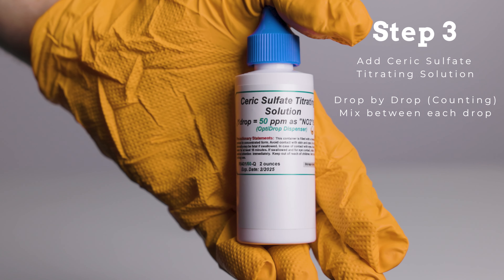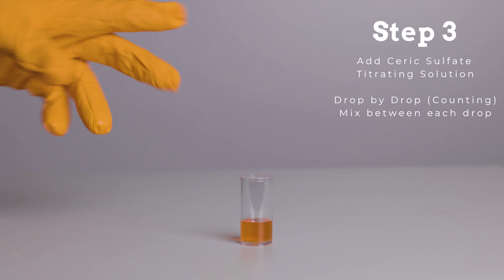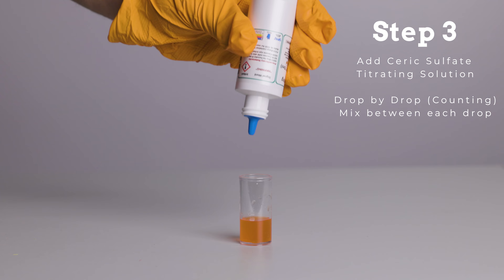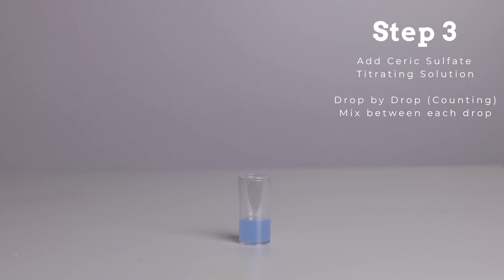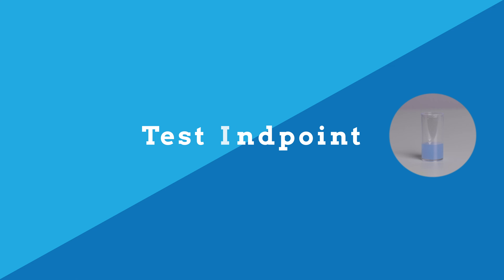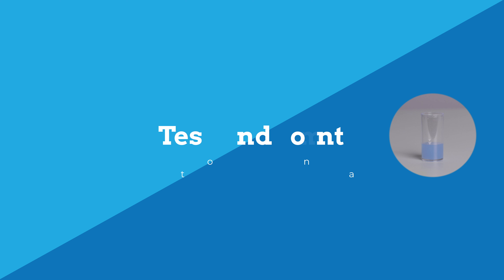Step 3. Add seric sulfate titrating solution drop by drop, swirling the test vial between each drop while counting them, until the water turns blue or a blue-green color and remains that color for 15 seconds. This is the test endpoint. Be sure to consult the included instructions sheet for further details.